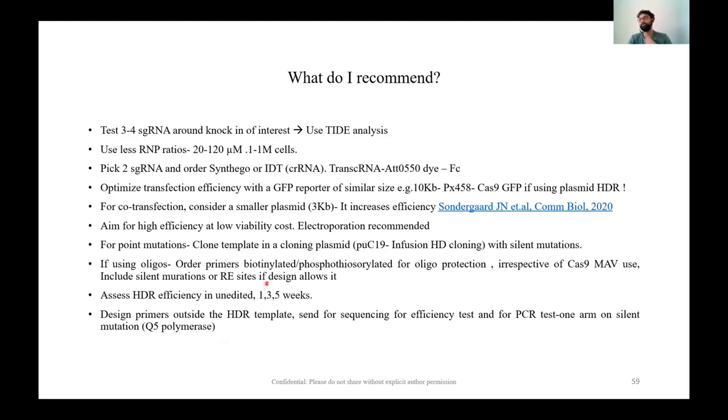And the only caveat is that this is not that sensitive a technique compared to something like droplet PCR or qPCR if you want to assess it. So the effect you might only see at 5 weeks. Make sure, please, that the restriction enzyme site is outside your coding region. You don't want to screw up any reading frame.